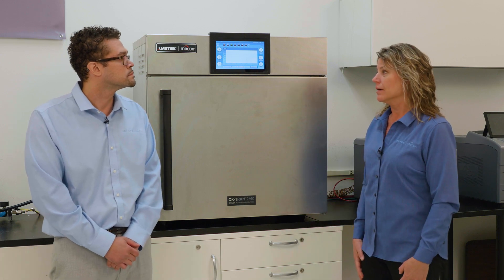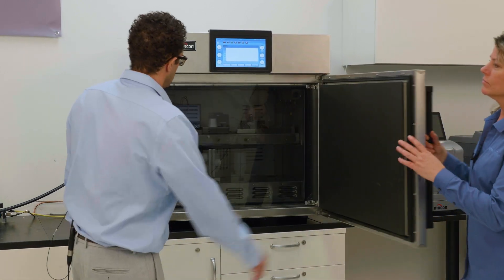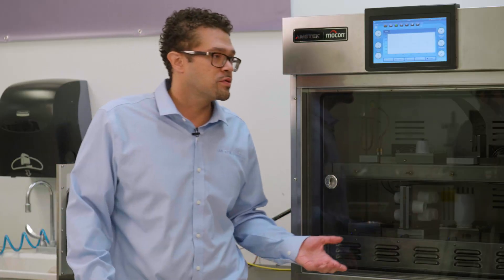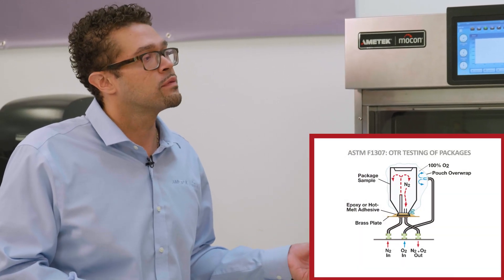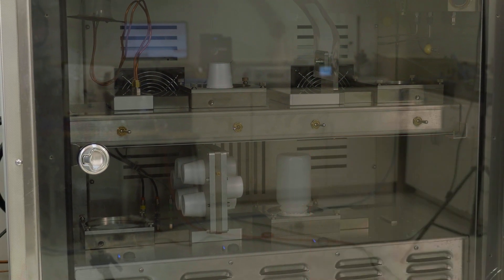So tell us a little bit about the Oxtran 240 for permeation testing. This instrument here is for testing whole packages. As you can see when we open it, we can simultaneously analyze four packages because there are four test cells. In our industry, a package is anything that's not a film, and this is also in accordance with ASTM standard F1307. It allows one to do sample profiling as well as R&D research.